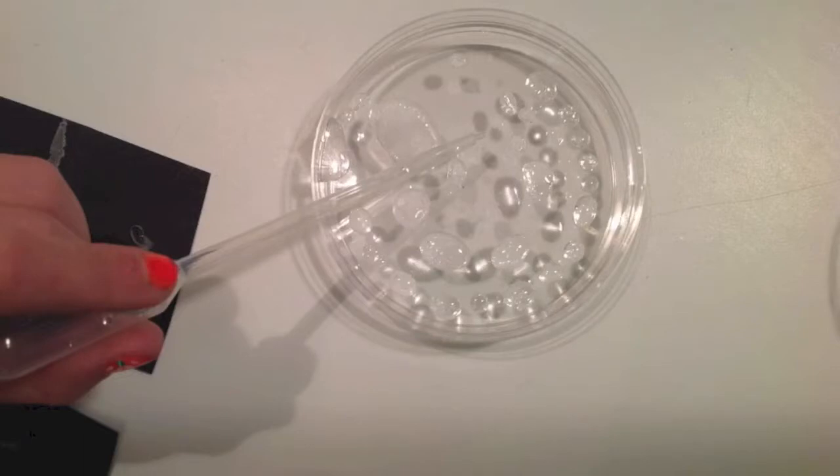Once you reach supersaturation, you want to take your pipette and make little beads of the solution in a petri dish and begin recording observations immediately because changes can happen very fast. Record color changes, record clarity changes. Does the water change from being clear to being cloudy? Record. This is all very important information for what you're doing.